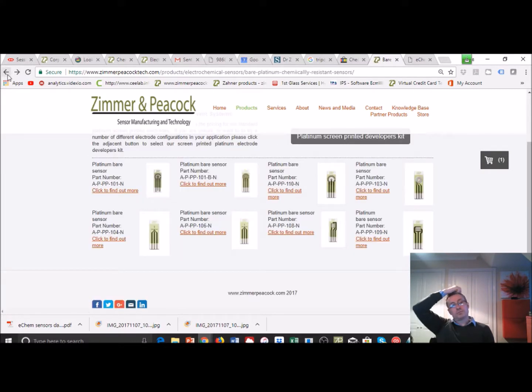So I said there were potentially three ways of looking at an engine oil: looking at the intrinsic electrical properties of it, i.e. its conductivity. The second way of looking at an engine oil: are there molecules in that engine oil, like additives, that are electrochemically active that could indicate the state of the engine oil? I know I've seen literature where there's imidazoles. There are molecules in there that might be electrochemically active. You know, I do put the word might in there. It needs to be discussed a bit more. But if I was going to try and do some cyclic voltammetry on an engine oil, you can try the gold, the carbon, and the platinum. And I would suggest the mini and micro electrodes, because if you use a macro electrode, you will end up having a lot of IR drop, which will distort any features. So it's good to have a smaller electrode, so you have less current, but it also means you have less IR drop, and you might be able to see features that you wouldn't have otherwise seen.